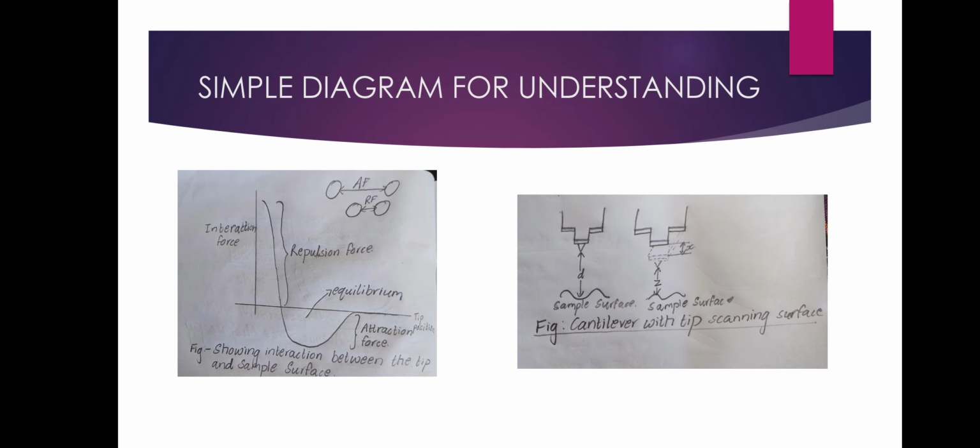So when we move the tip attached to the cantilever across the sample surface, the tip comes across the curved region as well as the flat region.